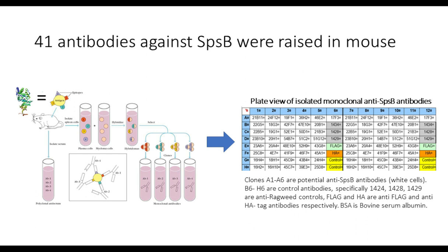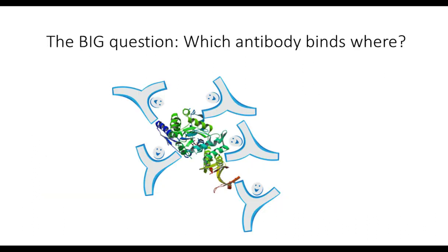And this technology is really only for linear peptides, continuous peptides, not for discontinuous ones. No structural epitopes. And everything was done in duplicates. So the big question really is, where do my antibodies bind to? Because this is extremely important for any further characterization.